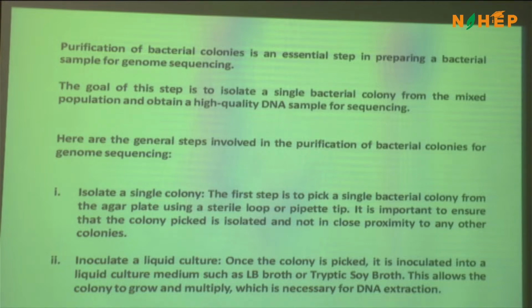So the best way forward, from day one, if you decide to go for genome sequencing of a bacteria, we'll come to metagenomics a little later, is to optimize the growth conditions and optimize the time at which you stop the bacterial growth. That stopping time is what gives you metabolically active bacterial cells. This is popularly called mid-log phase cultures.